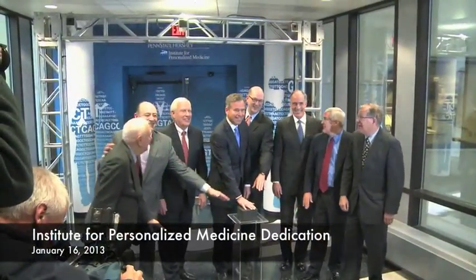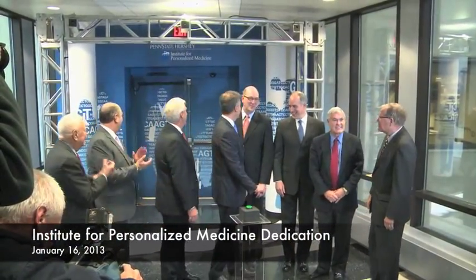We inaugurated the Institute in January of this year with the goal of bringing all the tools of molecular biology and genomics to bear on patient disease onset and on the response of patients to various disease treatments. I'd like to take you on a tour of the Institute. I want to show you the biorepository where we store our samples, the Genomics Center where we do the analysis of these samples, and the Bioinformatics Core in which we correlate the information that we get from the genomics with the patient records that we gather from the electronic medical records.